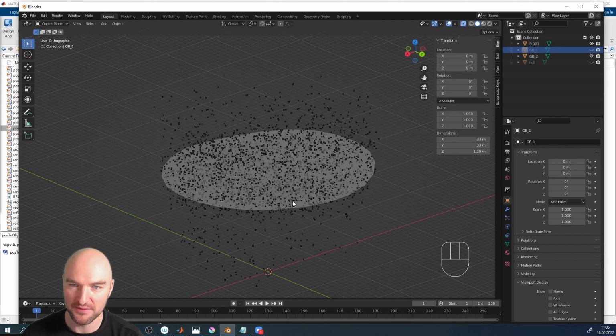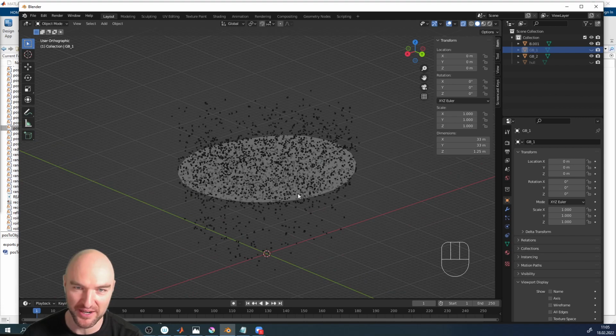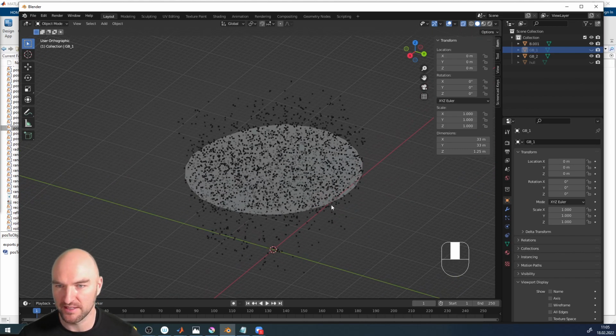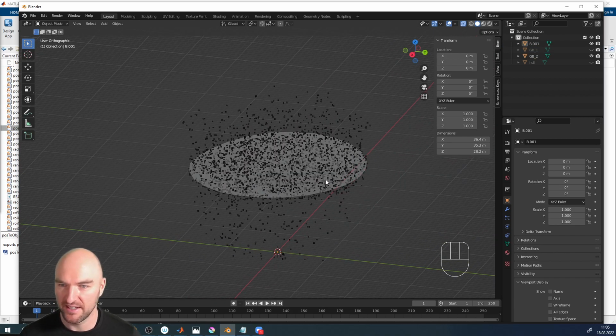I've now also installed the screencast keys. Sorry, I didn't have that before. Now if I do anything in Blender, you're going to be able to see what buttons I'm pressing and what I'm doing with the mouse, so that usually makes it much easier to follow. Sorry, I didn't have the screencast keys installed earlier.